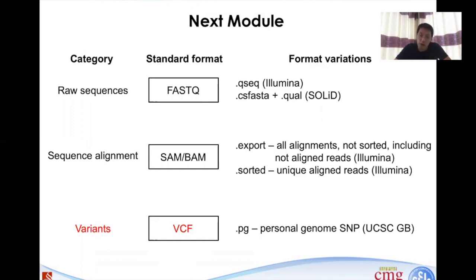And in the next module, we'll go through the last standard file format, which is the VCF file that represents the variant information.